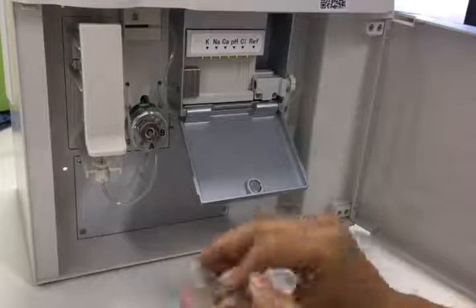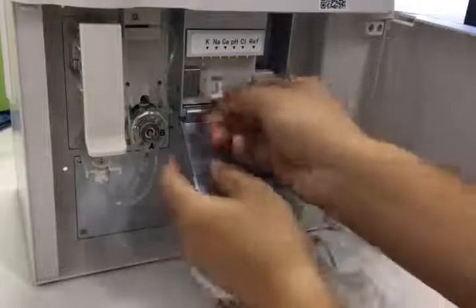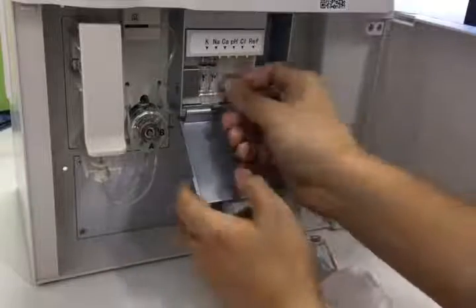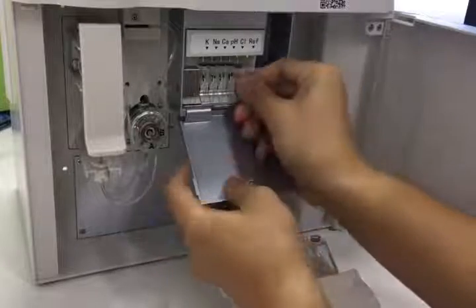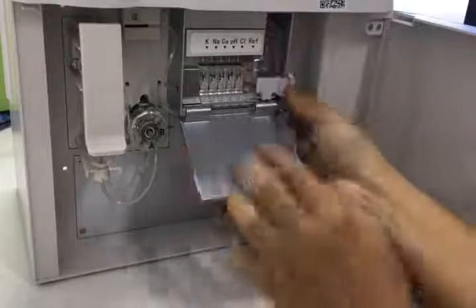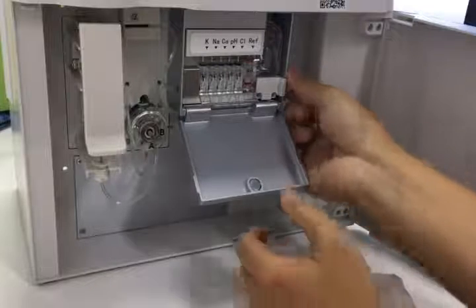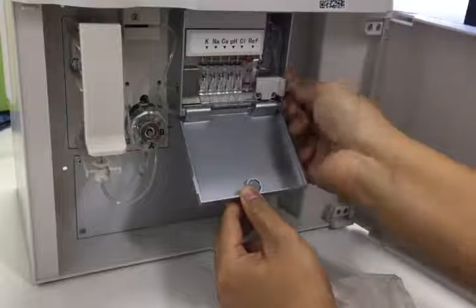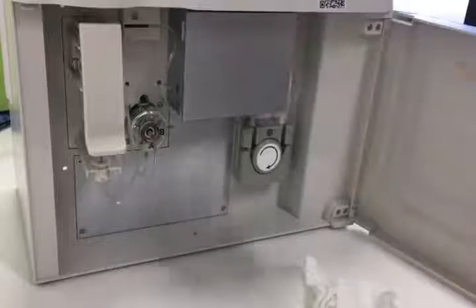Then we need to remove the bubbles in the electrodes for each electrode. Then we can install it. We need to tighten the knob, and you can press it to keep them in a single line. Tighten them and close the box. That's it.